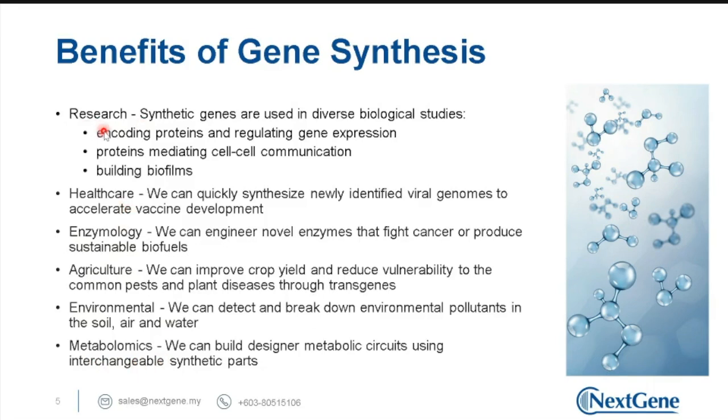In research, synthetic genes are used in diverse biological studies, including but not limited to encoding of proteins and then using the protein to regulate gene expression. Or you can use gene synthesis to express proteins that mediate cell-cell communication. Those proteins can be used to study the formation of biofilm as well.